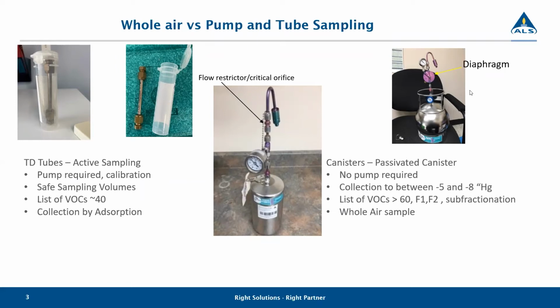When you're doing whole air, it is not as critical that the exact volume of the ending volume be known. Whereas when you're doing tube sampling with air, of course, that beginning and ending volume, that determines your concentration based on that and the time sampled. So it's really important to know that there is a distinct difference. It does make whole air sampling in some ways easier, but it does always cause a concern, especially with field staff, when they see those numbers slightly vary.